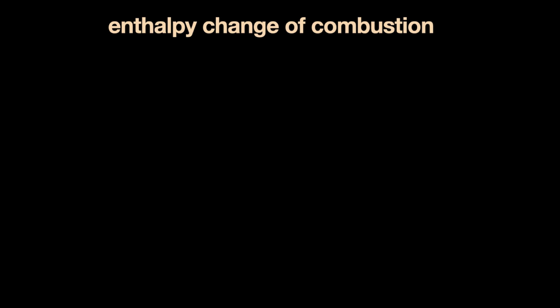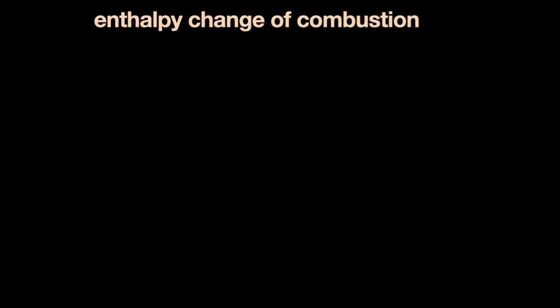That's combustion. You've seen that in alkanes in organic chemistry, and alkenes also. Alcohols combust. All organic compounds undergo combustion. And how are we supposed to find the enthalpy change of such reactions? Now remember, you will not be asked to find the enthalpy change of combustion reactions of gases, because you can't do that in the lab. But what you can do is find the enthalpy change of liquid fuels like alcohols.